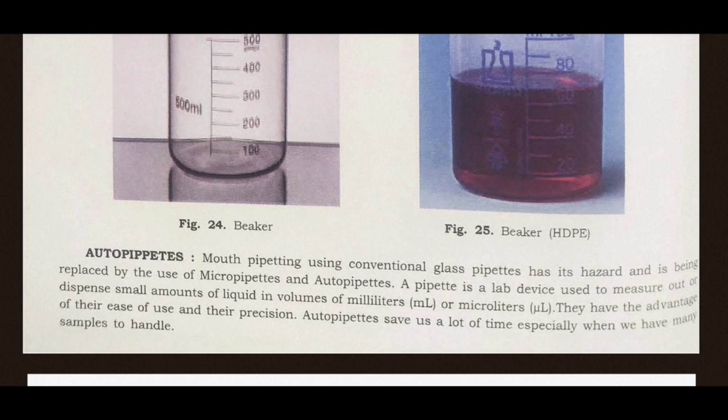A pipette is a lab device used to measure out or dispense a small amount of liquid in volumes of milliliters, ml, or microliters, μl. They have the advantage of their ease of use and their precision. Autopipettes save us a lot of time, especially when we have many samples to handle.